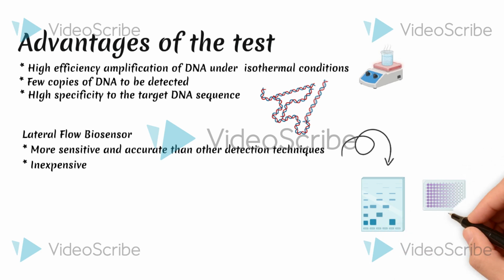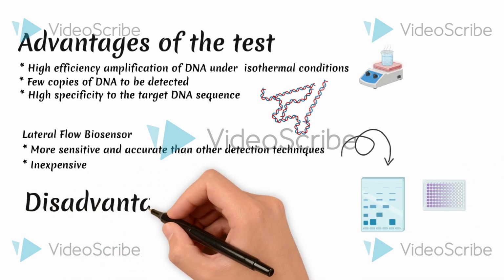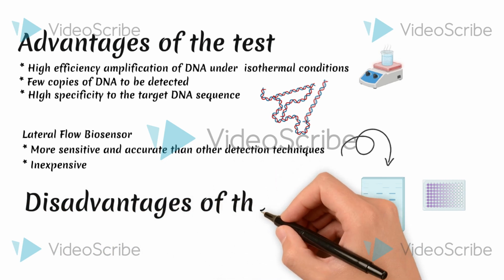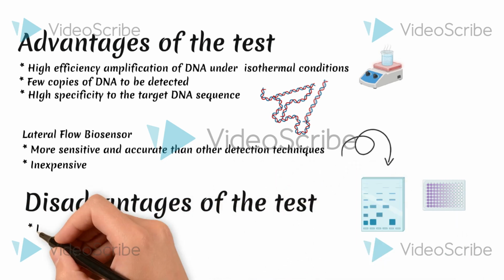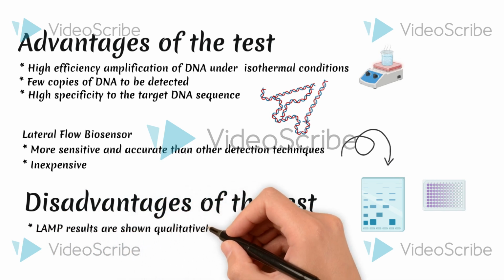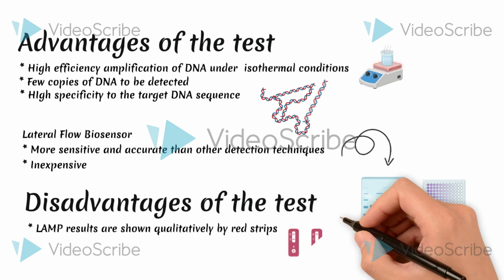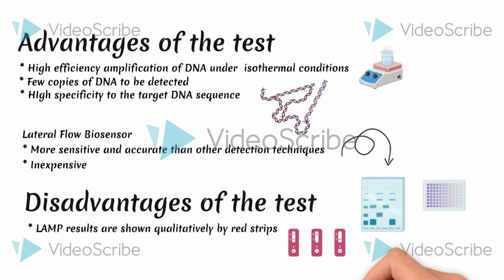Currently, there are no laboratories that sell a LAMP lateral flow biosensor test for Haemophilus influenzae. However, there is an estimated price that ranges from $2 to $6 reported for Candida albicans and for SARS-CoV-2. Thus, we expect that the LAMP lateral flow biosensor test for Haemophilus influenzae costs about $5 to $6 per disposable test.